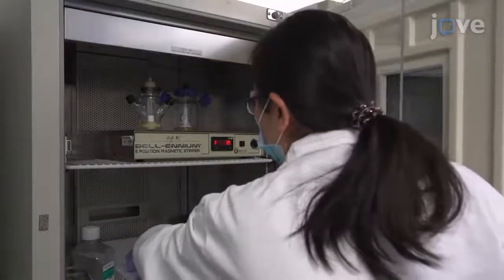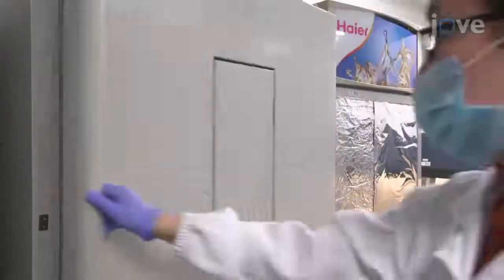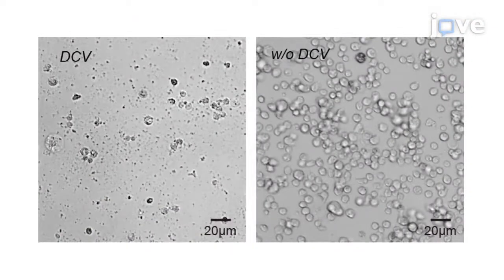Then return the plate to the 25°C incubator for 3 to 5 days. The virus is ready for collection when the cell morphology looks blurry, and the culture medium is full of black particles, indicative of cell debris.